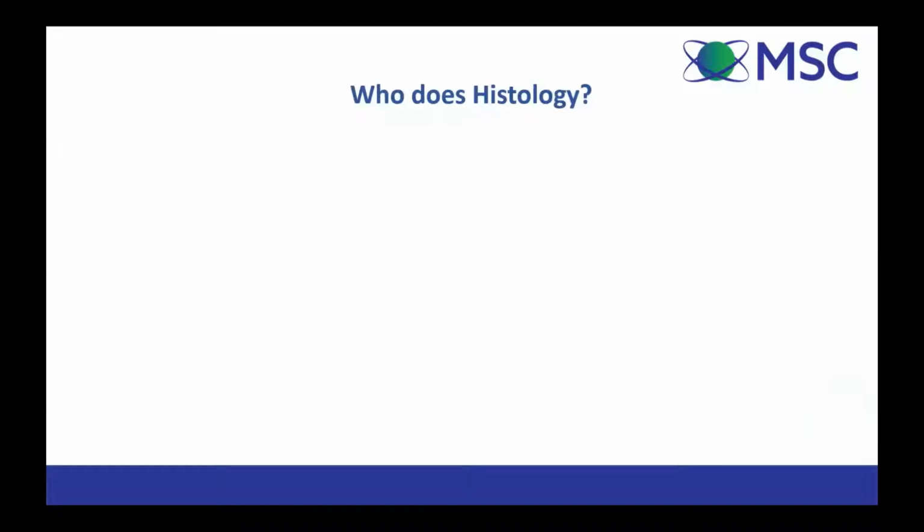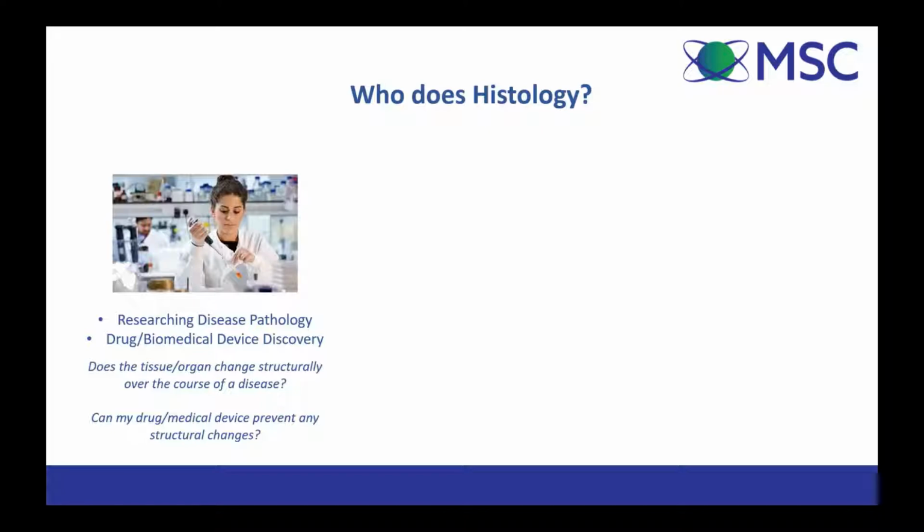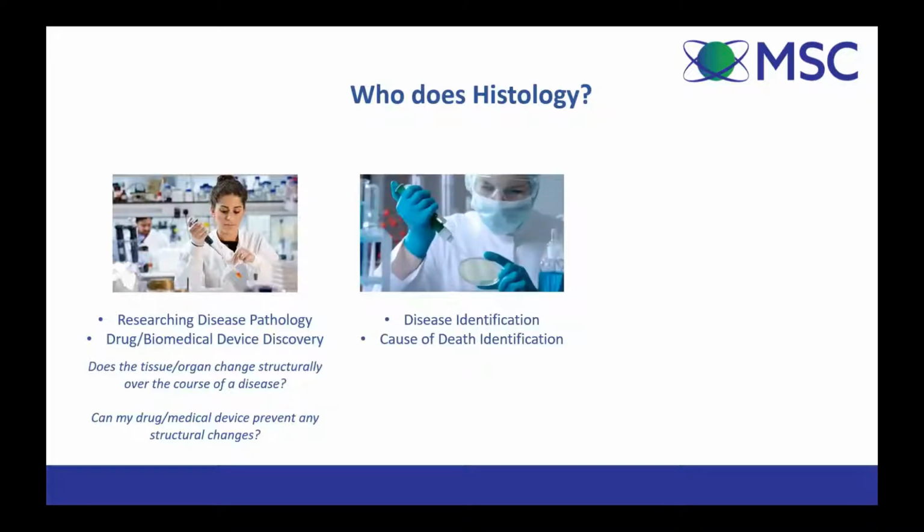So who does histology? Well, there's obviously you guys in research. You research disease pathologies and do drug and biomedical device discovery. So you're asking questions like, does the tissue or organ change structurally over the course of a disease? Or can my drug or medical device prevent any structural changes?